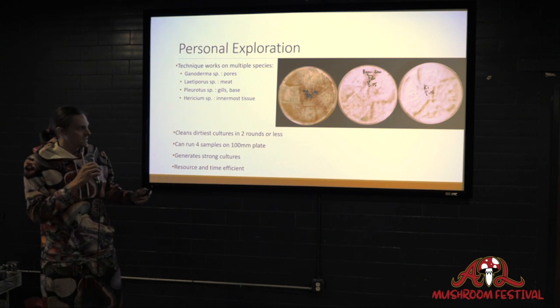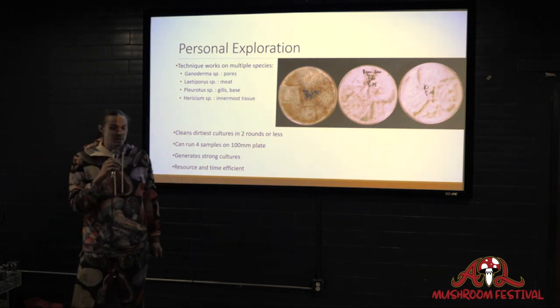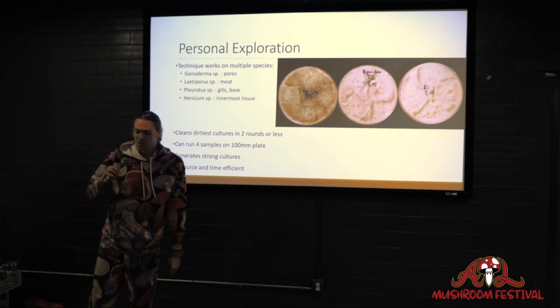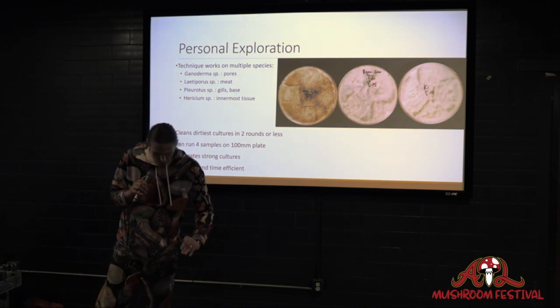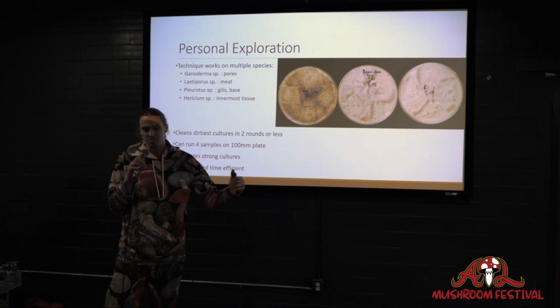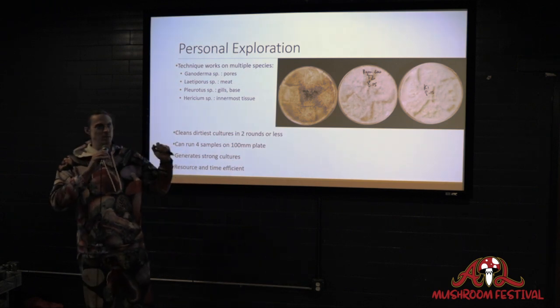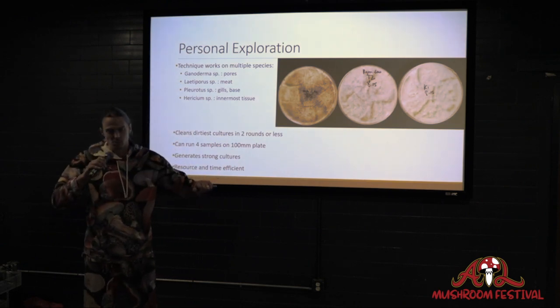And so this technique is not only effective, but in 1 to 2 rounds, you can get completely clean cultures. So if you want to be super, super anal and you want to know for sure there's absolutely no chance there's bacteria, you do 2 rounds of this technique that's 97% effective, and you get a dangerously close number to 100% effective at removing all the stuff that you don't want.